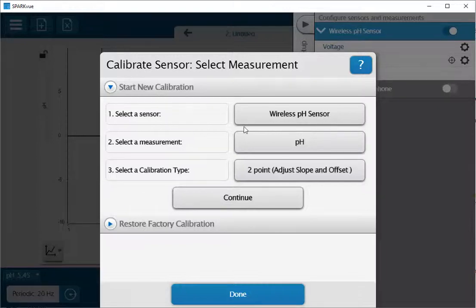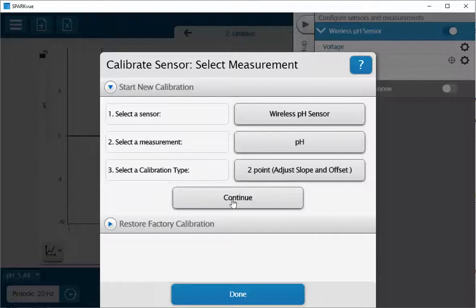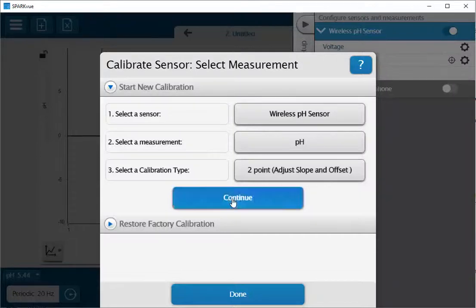I can see that I'm going to be calibrating my pH sensor and I see that I've got the two-point method here and I'll click on continue.